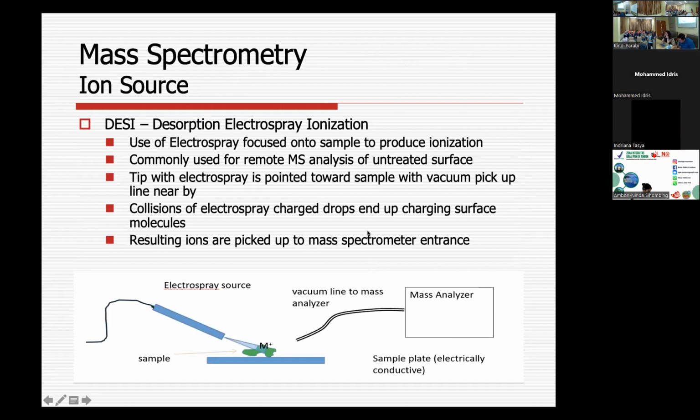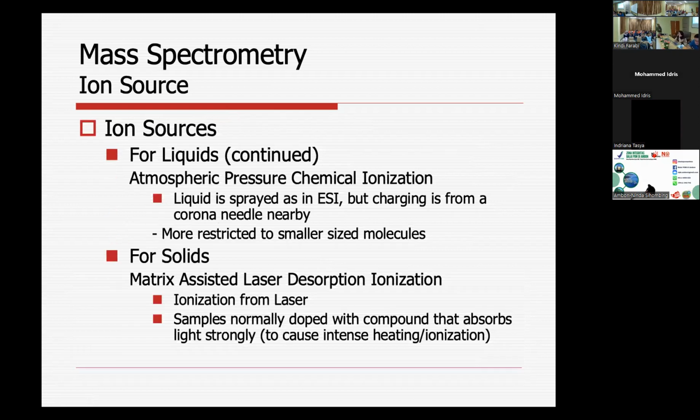Berikut, ini ion source juga. Ini teknik yang lain, yaitu desorption electrospray ionisasi. Ini menggunakan electrospray yang difokuskan terhadap sampel untuk menghasilkan suatu ionisasi. Ini juga sama, prinsipnya akan menghasilkan suatu ionisasi. Ini teknik mengionisasi.